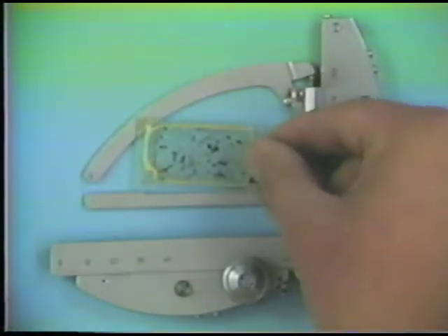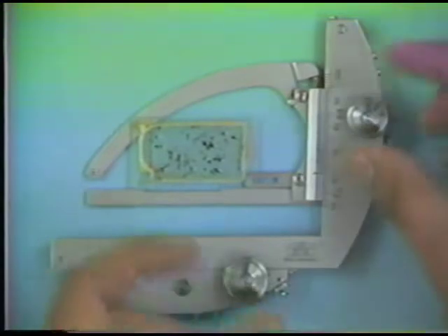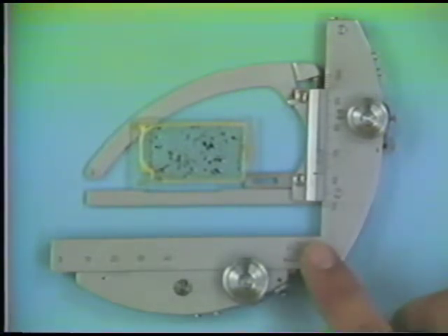The thin section can be placed right in between these clamps, and you can rotate these screws so that you can precisely orient any sample and reoccupy any position within that slide very, very precisely. Now, most of the time that we're using the petrographic microscope, we don't use this mechanical stage, but during special kinds of orientations, we do use it, and it's a very, very useful device.